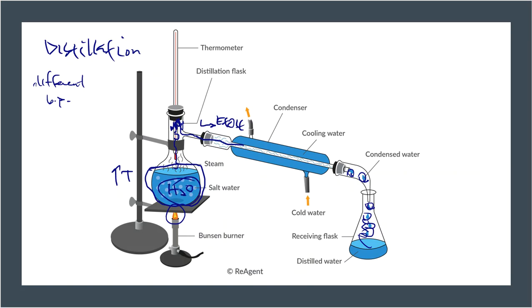And that water, like I said before, out of the tap is a chemical soup of different things. There's organic pieces there. There's inorganic pieces there. There could be bacteria there. Hopefully that stuff is dead. But there's a ton of different stuff in tap water, and we need to clean that up. That is not suitable to be used. So we can heat that up, and as we heat it up, it will evaporate and turn into a vapor. It goes up and through a condenser and begins to condense, aka gas turns to liquid, and we can collect that clean water on the other side.